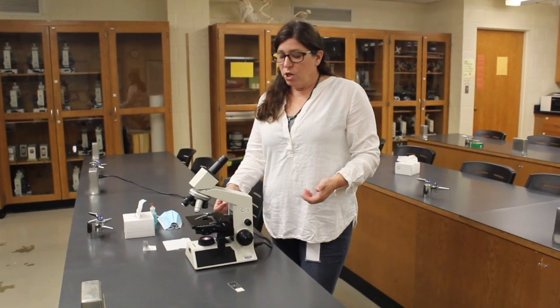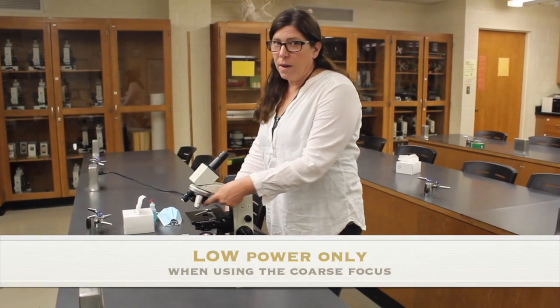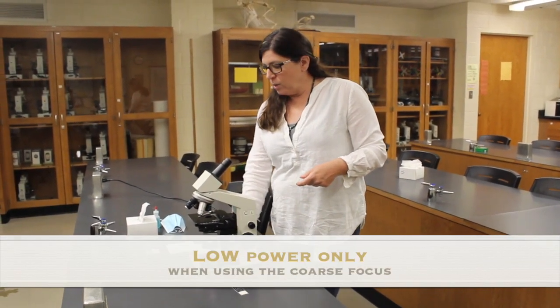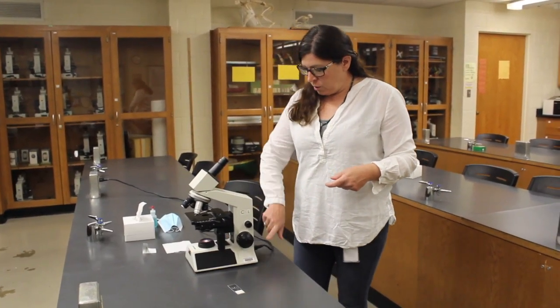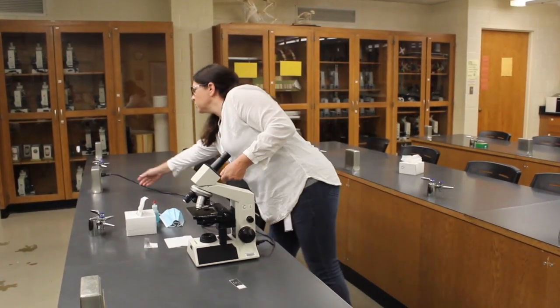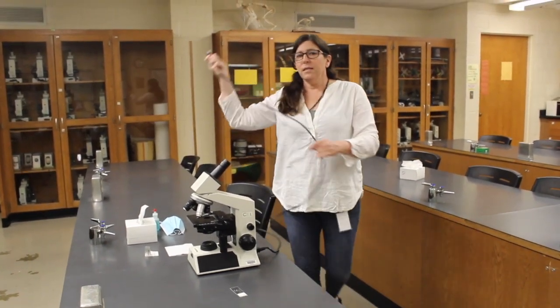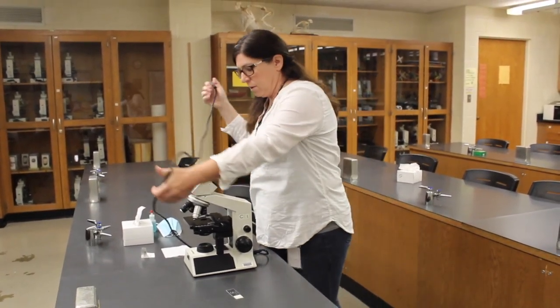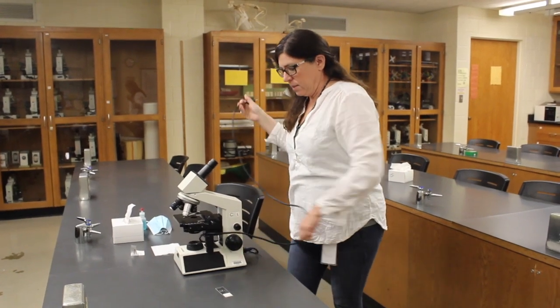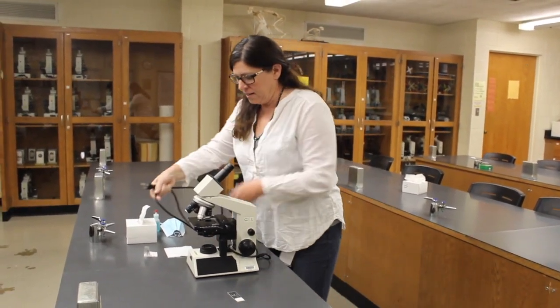To put this particular model of microscope away, you're going to have to raise the stage back up a bit. As long as you're on low power, that's okay. So you're going to raise that back up a bit, and then you're going to turn the power off and unplug the microscope. The next thing you're going to do is wrap the cord around the base like you did when you found it. Always a fun process.